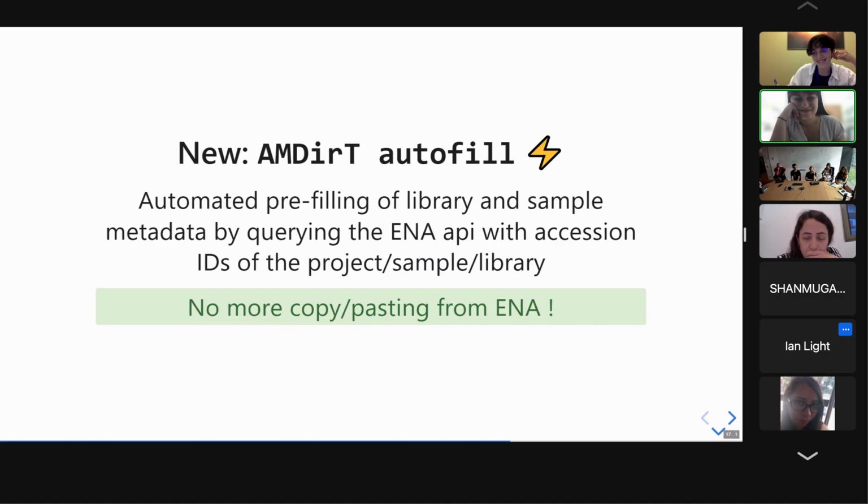I don't think there is a limit. The limit is also that you should still check that the metadata entered are correct. So if you contribute hundreds or thousands of samples at a time, it would be harder to check, and also to review afterwards. So it's better to do it maybe study by study.